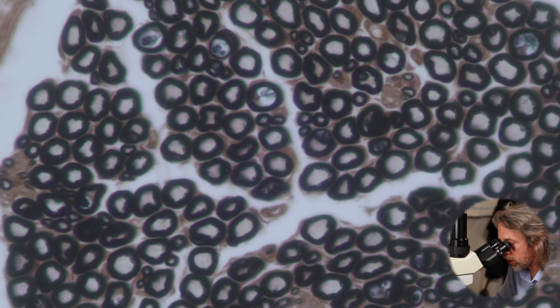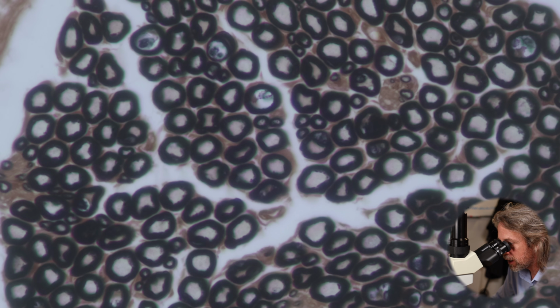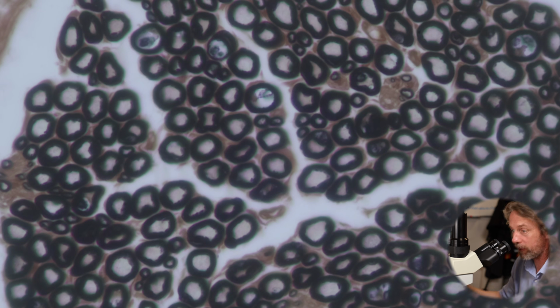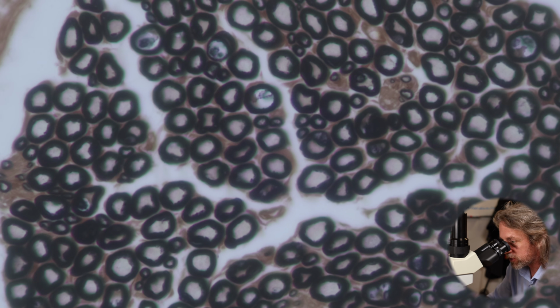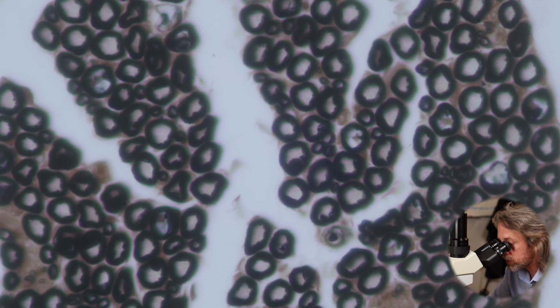Now, I should go to a different plane of section if I'm going to see a node of Ranvier, because these Schwann cells don't run continuously the whole length of the axon. There's a Schwann cell, little gap, Schwann cell, little gap, Schwann cell, little gap, and that action potential only needs to be generated at each node of Ranvier. Hence why it's so much faster than having to run the entire length of a neuron. But I'm kind of enjoying looking at this.